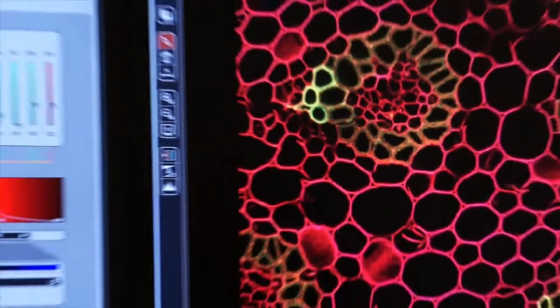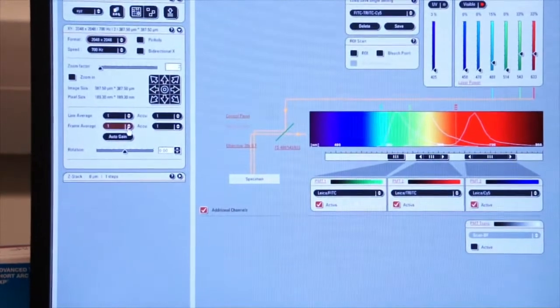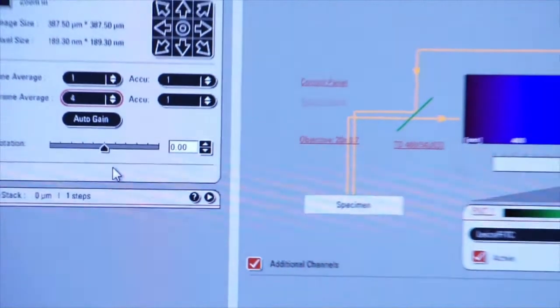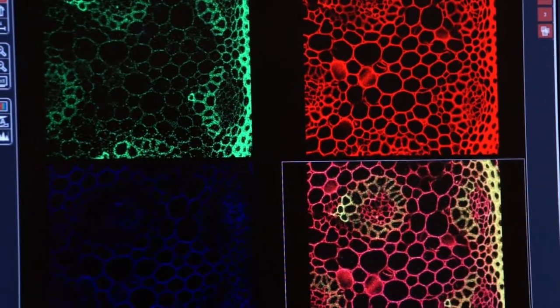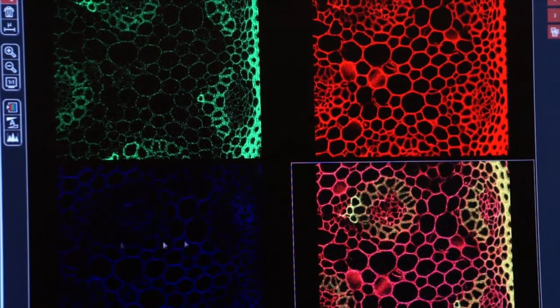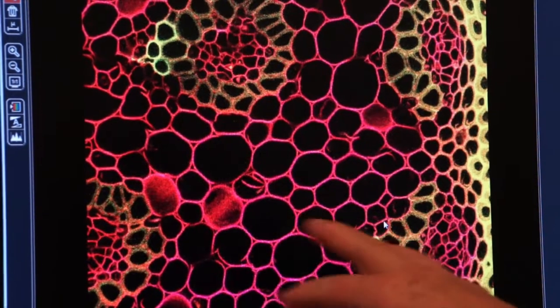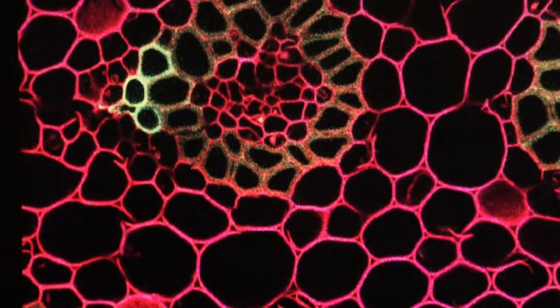Let's go back and turn off line averaging. We'll make that one and let's do frame averaging again. We'll do four. Now we're going to click on capture image and watch the image on the right screen. This is a little faster. Again frame averaging is always faster than line averaging but it doesn't return as nice a result.